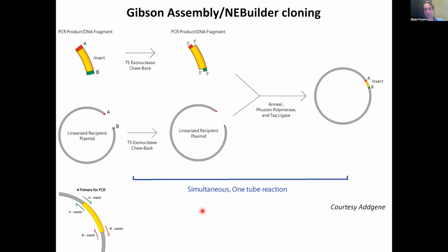This is the only technique that we use in our lab, with those variations I talked about. If possible, we tend to use restriction enzymes because the downside of PCR is it does have an error rate. So if you use this method of round the world PCR for your vector, you end up having to do more Sanger sequencing verification to make sure you didn't insert some sort of mistake, especially since a lot of our donor plasmids are on the order of 10 to 20 kb long.